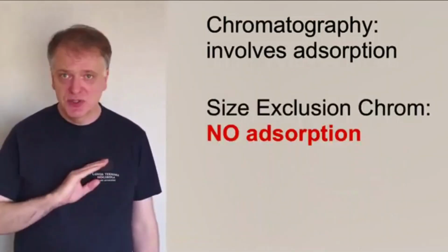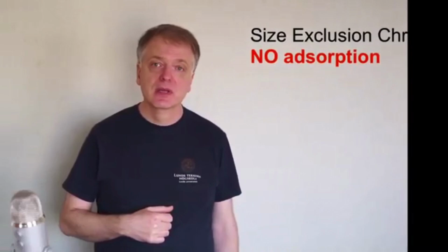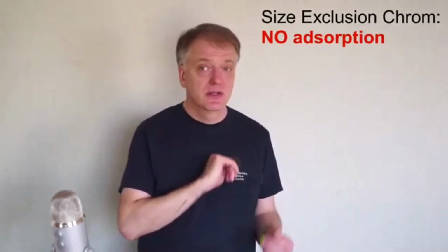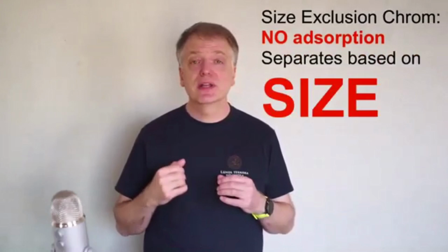However, that is not the case in size exclusion chromatography. There is no interaction at all between the molecules and the surface of the porous particles. No adsorption, nothing. Instead, size exclusion chromatography separates molecules based on their size.